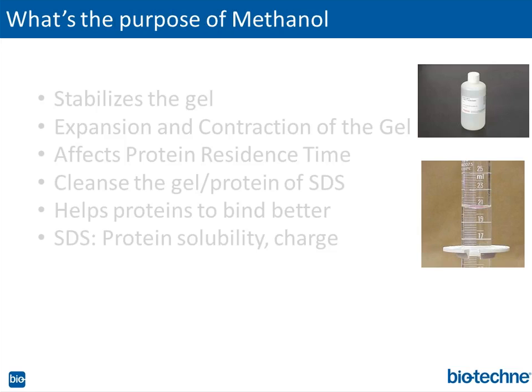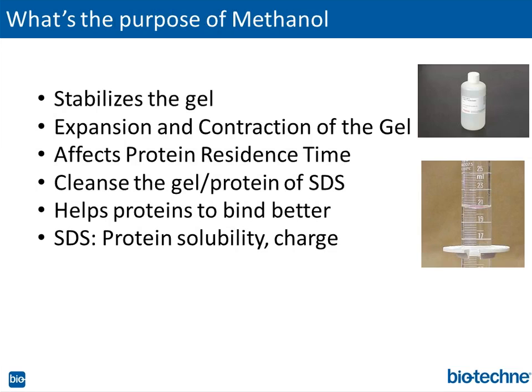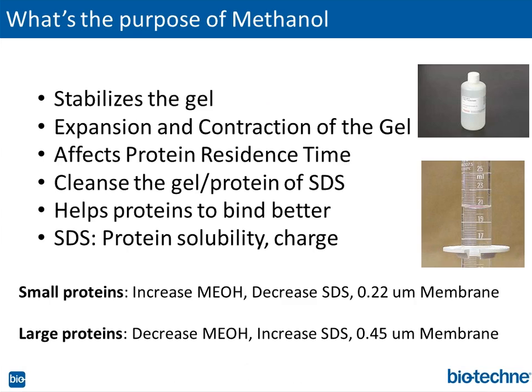All right. Everybody uses methanol, right? 20%, maybe 10%, but I can almost guarantee you that most people don't know what methanol does. It's the necessary evil here. So let me just describe two things as to why you use methanol. And I'm going to give you the general rule here. So look, if you took a gel, and this was more profound, of course, when you had poured your own gels and they're much bigger, but if you just used buffer without any methanol, and you had a gradient gel, you know what's going to happen?